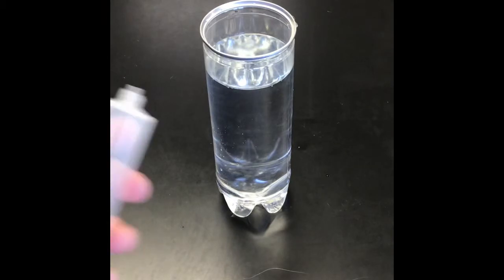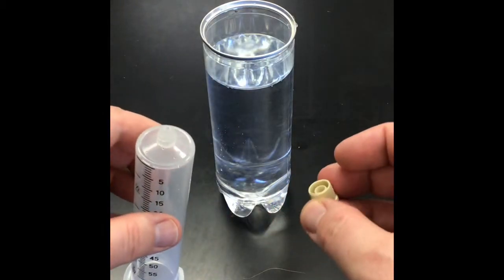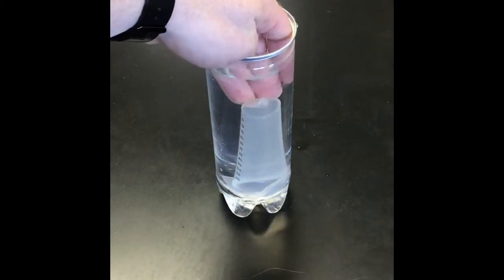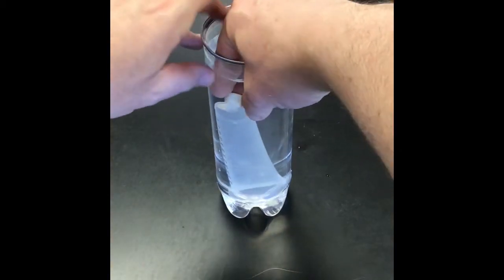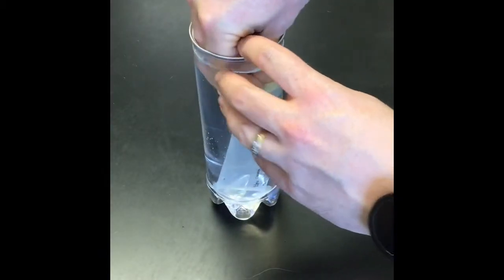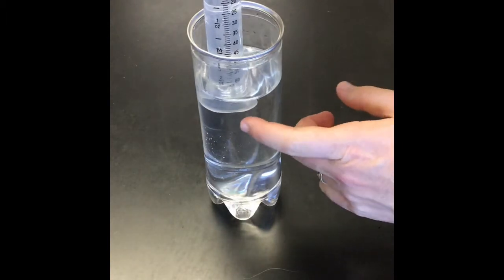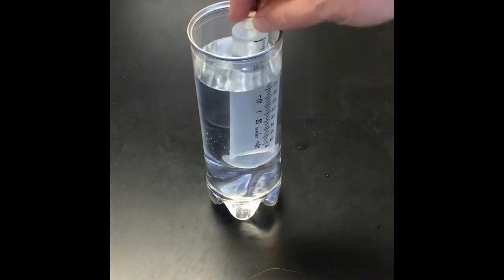And then what you want to do is take the 60 milliliter syringe barrel, with the tip cap off. You're going to use this in a second, but for right now, take the barrel and put it down into the tennis ball canister, and submerge it completely, and then take the tip cap and put that on there. Okay, so once that's on there, now you have a syringe completely filled with water. And as long as the bottom of that syringe, the opening, doesn't break the surface, that will still stay filled with water.